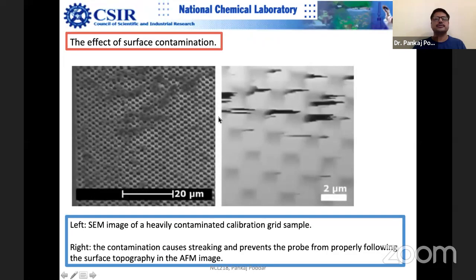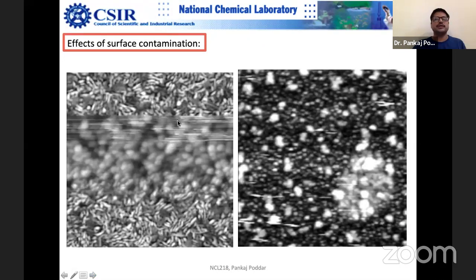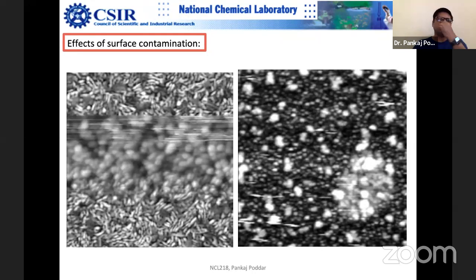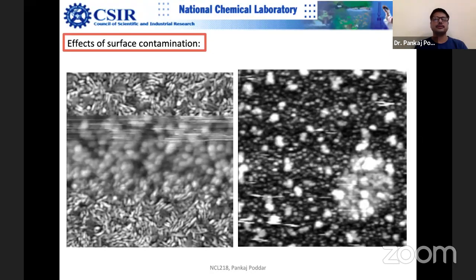A very common problem: if these kinds of lines start appearing in the image, the tip is contaminated. A particle got stuck on the tip while imaging. Students often don't know what has gone wrong. Normally after a certain time, these particles get dislodged from the tip automatically due to the adhesivity between the particle and tip not being strong enough. You're lucky that most likely these particles will get dislodged after some scanning.